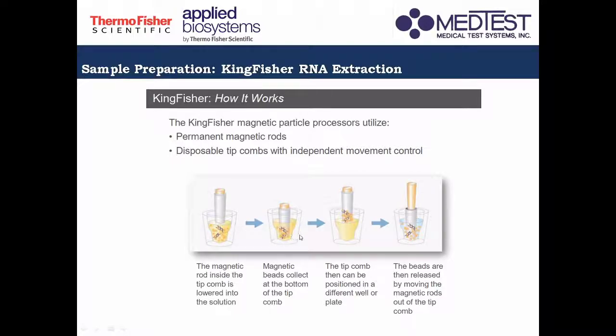And when pag tumaas na po yung magnetic base, kung tumaas na po yung magnet, basically, matatanggal din yung mga beads doon sa reagent. So sineseparate niya yung beads from the reagents as well as the other cellular materials.